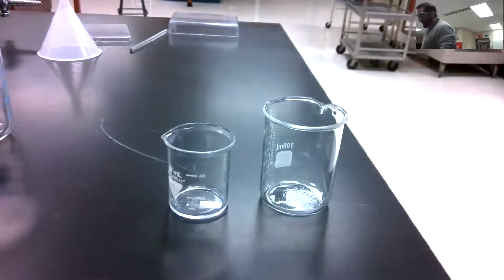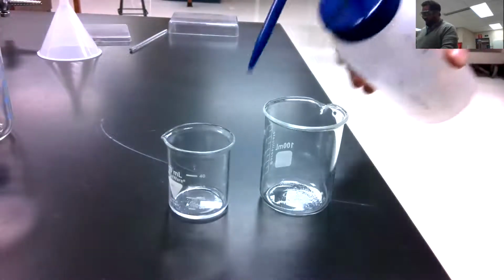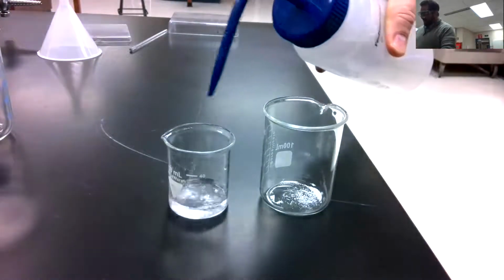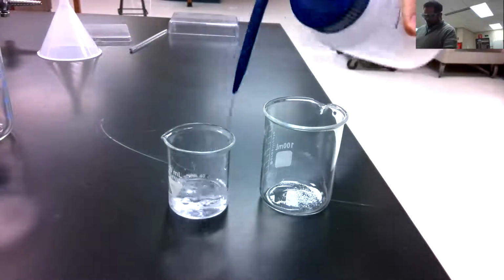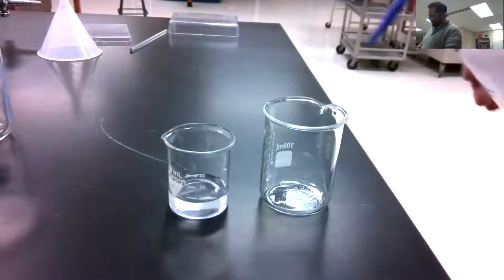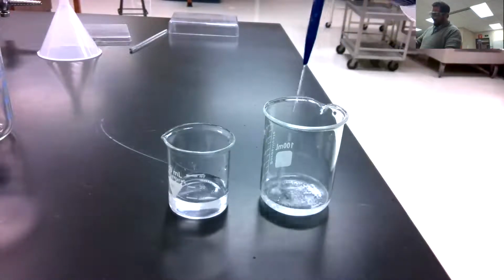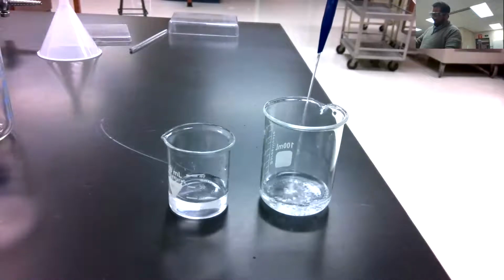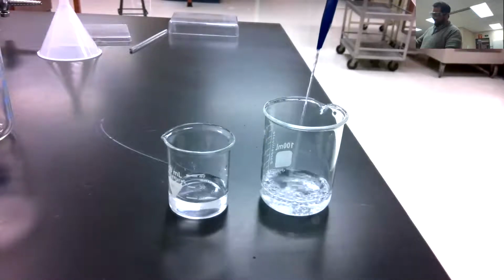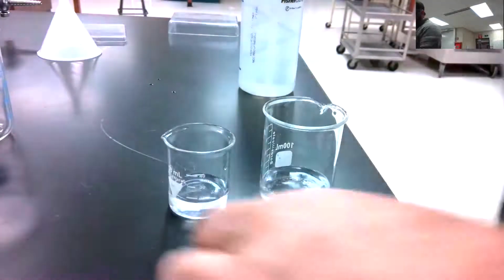The overall volume of water is not terribly important for this lab. We're not going to worry too much about the water. The instructions say add about 20 milliliters. Again, the overall volume is not important. It's close to 20 milliliters. I'll add about 20 milliliters here. I want these salts to dissolve.